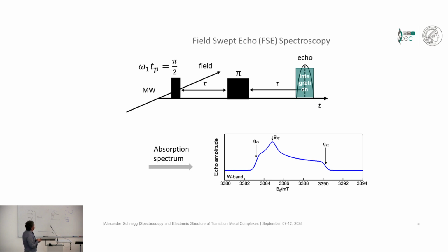In EPR, there's another challenge which I mentioned, but you might not have fully gotten it. In NMR, we can make our RF pulses short enough to excite our whole spectrum at once. In EPR, our so-called excitation bandwidth, this is the inverse of our pulse length, is oftentimes not sufficient to excite such a whole spectrum. Instead, we are just burning a small hole into our spectrum.